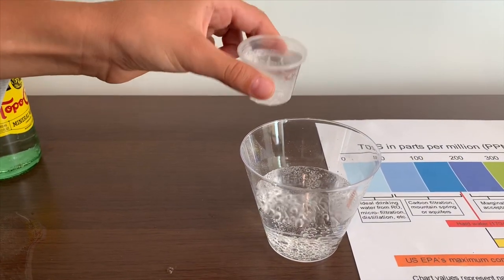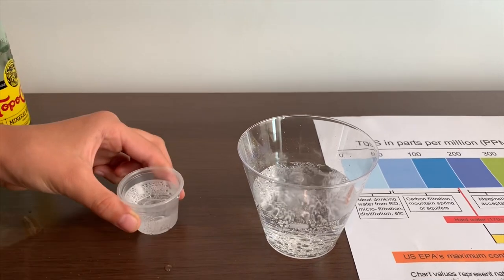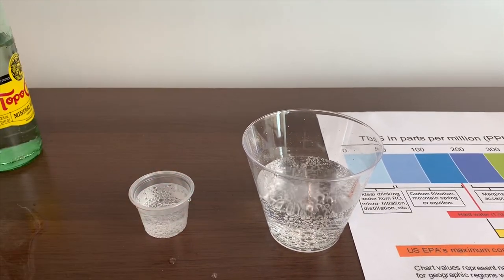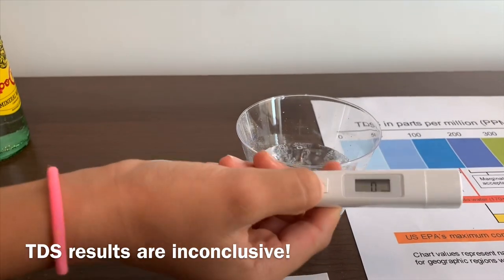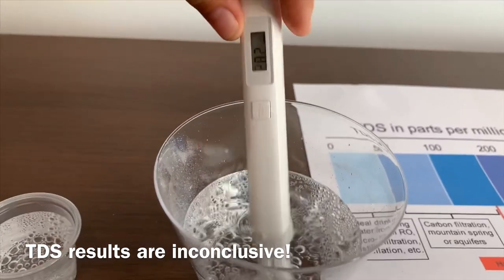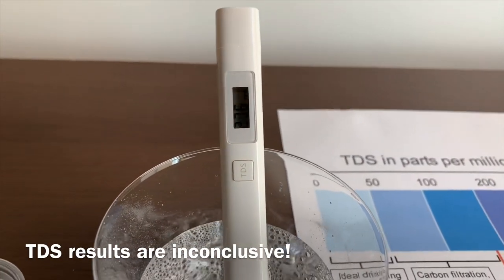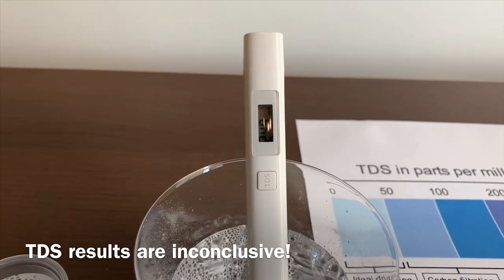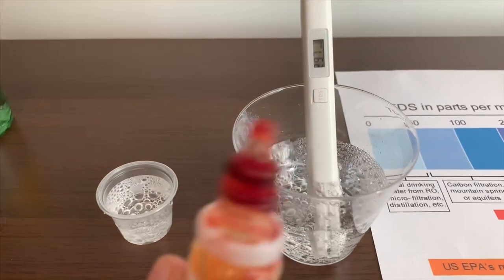Let's pour some back in because it's a little too much. Let's do the TDS level first. Make sure it says zero. Put it in. It's average tap water. Now let's test the pH level.